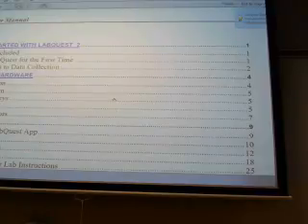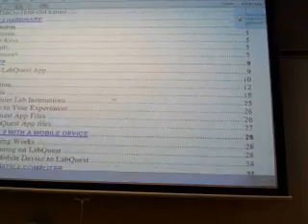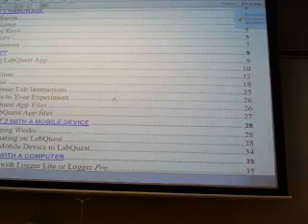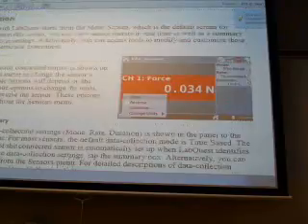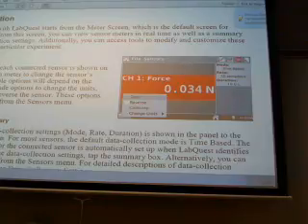Every 1 minute, we're going to do... So the power button, touch screen, hardware key, sensor port, internal sensor. We have the LabQuest app, navigating that, data collection, data analysis. So we're going to just jump straight to data collection here. Data collection with LabQuest starts from the meter screen, which is the default screen for the LabQuest.